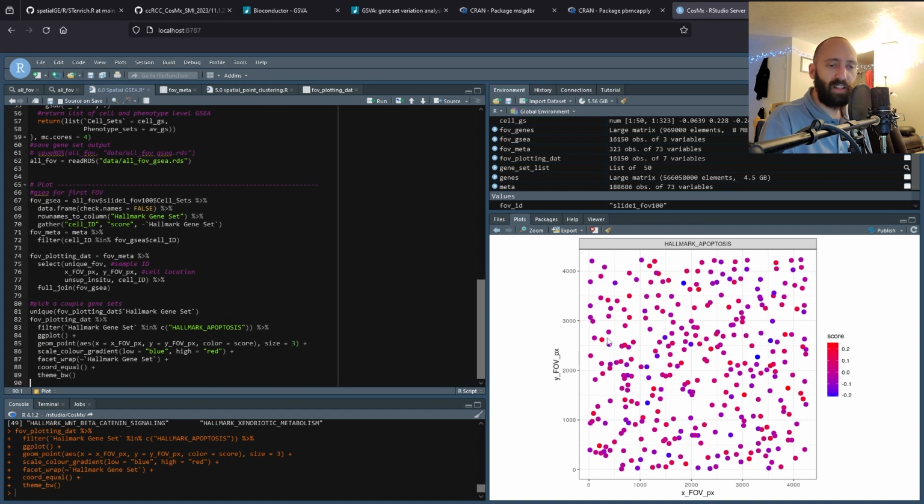So here is the output. I don't see anything that really stands out. Looks like the really low scores are kind of scattered everywhere. Some of the high scores are a little bit clustered, but it's not a great scale to see.